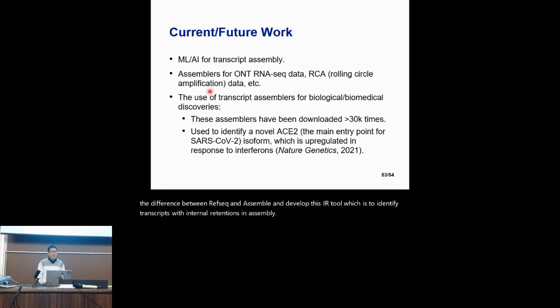So is transcript assembly a solved problem? Absolutely not. Currently, we have developed an interest in using machine learning and AI techniques to do assembly. We have used a random forest model to score transcripts, but here we want to do end-to-end assembly. And also we are developing methods to assemble certain types of data like nanopore data or rolling circle amplification data. And we are also very interested in the downstream use of assemblers for biological or biomedical discoveries.